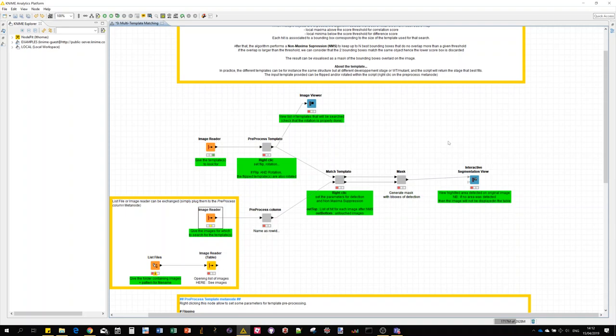Hello, in this video I'm going to show you our implementation of multiple template matching in the KNIME analytics platform. To begin, I'll show you how to install it. The whole thing relies on KNIME and a set of extensions.